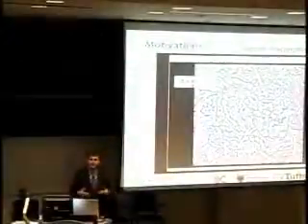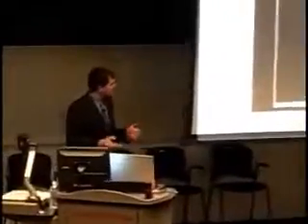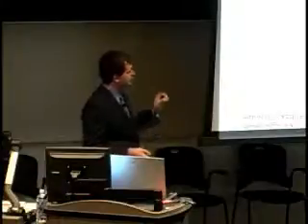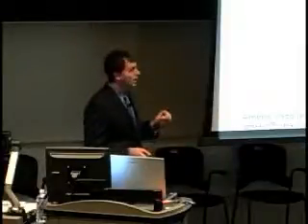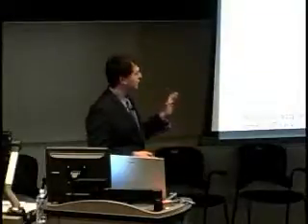So, as you can imagine, this is a very labor-intensive effort. It's also very time-consuming, especially when we are dealing with thousands or millions of neurons and also gigabytes of data. So we can summarize the motivations of our project in 3 main points. First, most common segmentation methods for neuron reconstruction rely too heavily on the user. That is, they are too manual. Also, there are not any existing 3D visualization tools that can handle this type of data sets. And also, to the best of our knowledge, there are not any existing efficient workflows that really just help the neuroscientists focus on the science.